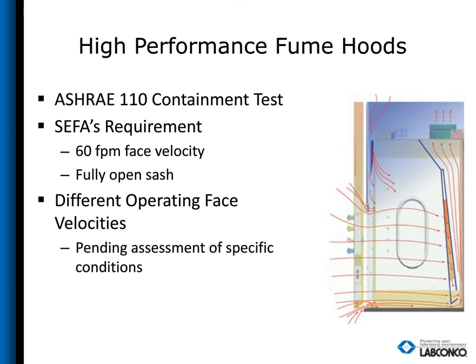First, I'll go over the industry standard containment test for fume hoods called the ASHRAE 110 test. It's a three-part test that does a face velocity profile, measuring the face velocity about every square foot to look for a uniform face velocity across the entire face of the fume hood. Then the second part is a smoke visualization test, and that shows how the air interacts with the fume hood. The smoke is a great tool to allow people to see the air and what it's doing in and around the fume hood. Then there's the containment test, the third part, where a tracer gas is used to see how much can be traced within the breathing zone.